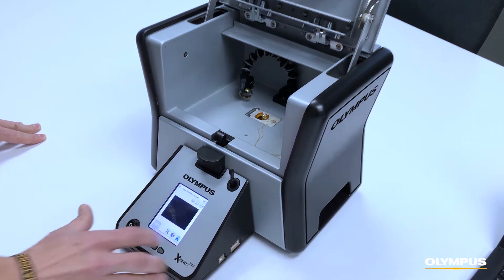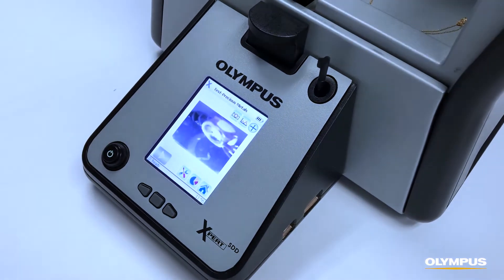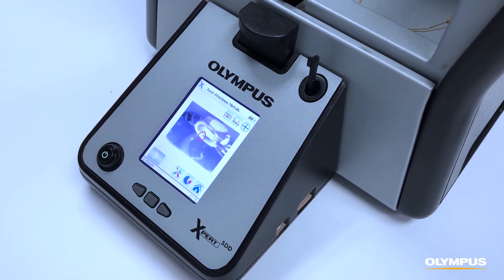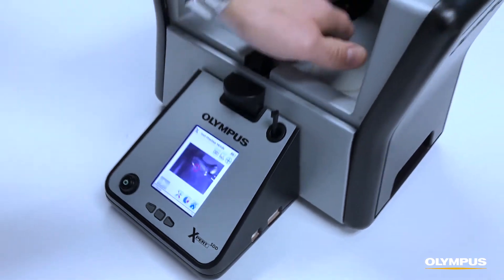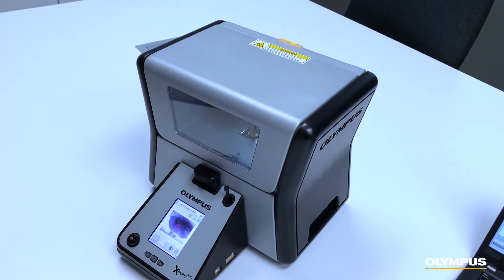The aiming camera allows you to know exactly where you're testing, and you can use our small spot feature for jewelry and other small items.